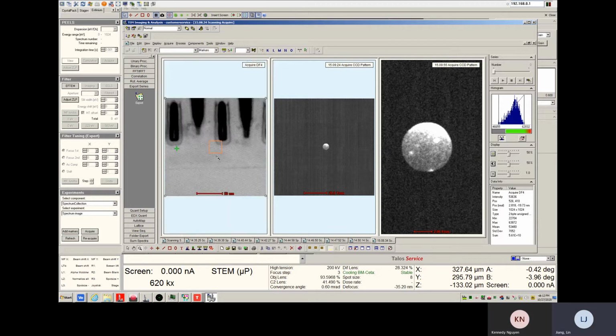If I press add marker on the left, in the experiments, I already clicked. Is this one, right? Yeah, you can also click that one. And then you can make it bigger.